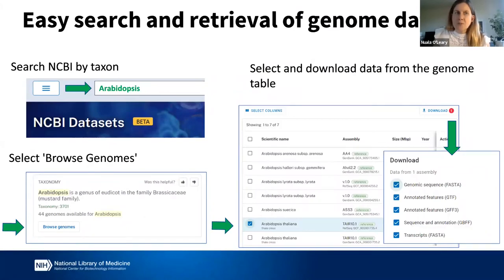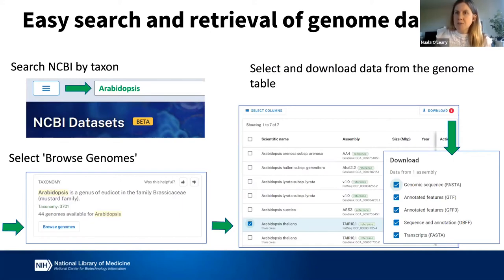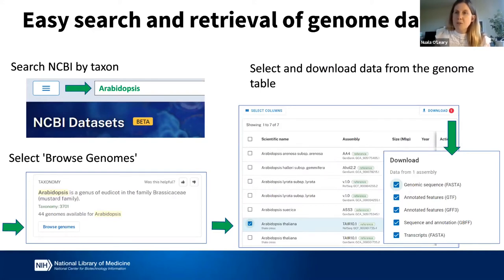So how exactly are we making this easier for users? We've created a genome service where you can come to the NCBI homepage or to the Datasets landing page and search by the organism that you're interested in. In this case, I'm showing Arabidopsis. You search for that organism, a box will come up, and it will show you how you can link over to browse all the genomes available for that genus. This will take you to a table where you can select the genome assembly that you want.